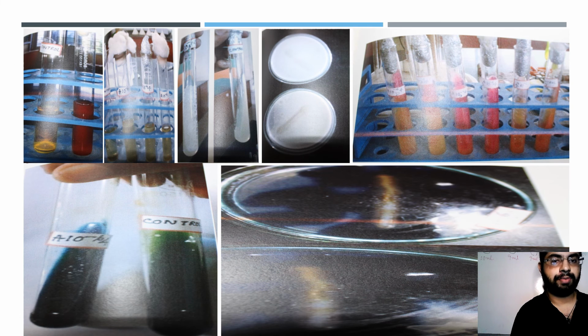So you see these pictures. This is the starch hydrolysis test. This is the casein hydrolysis test. And these are urease and indole production tests. There are different tests for biochemical characterization of microorganisms.